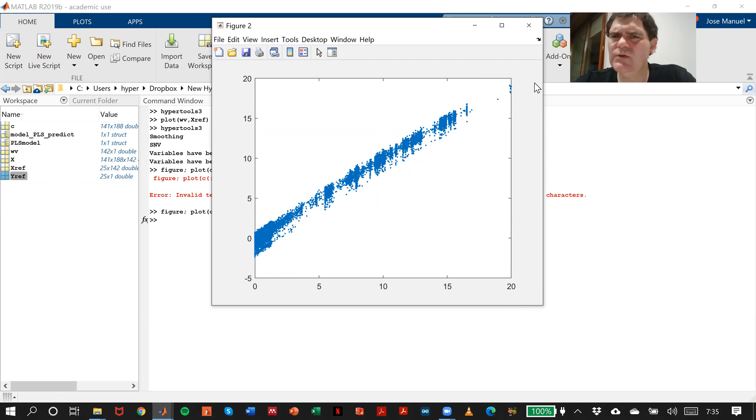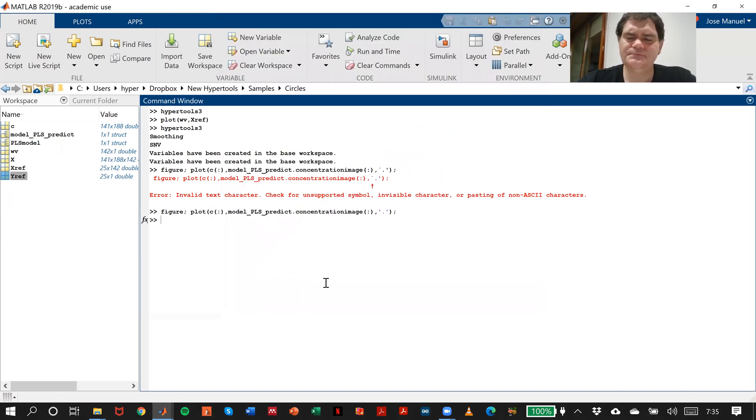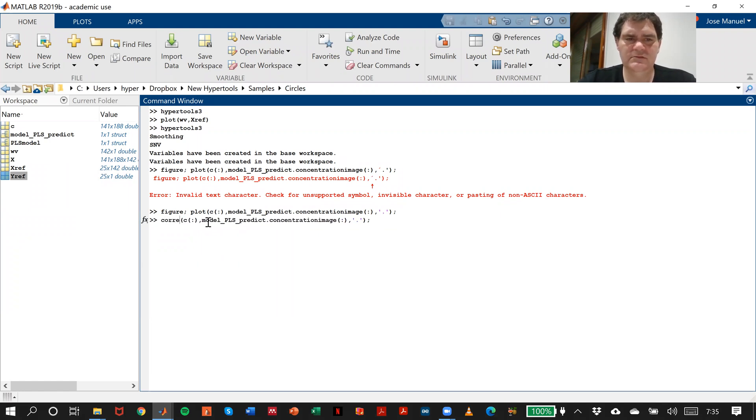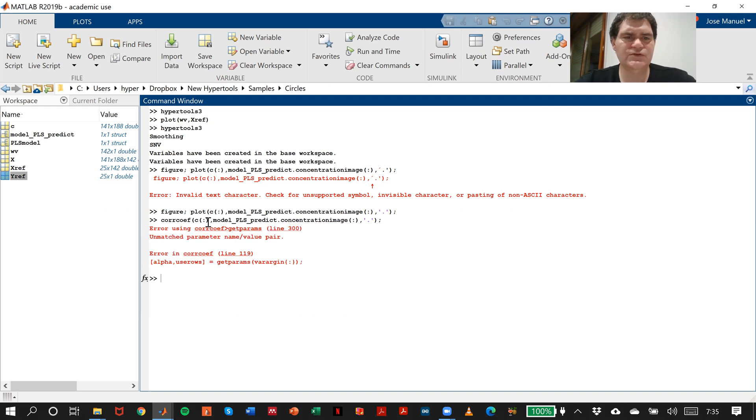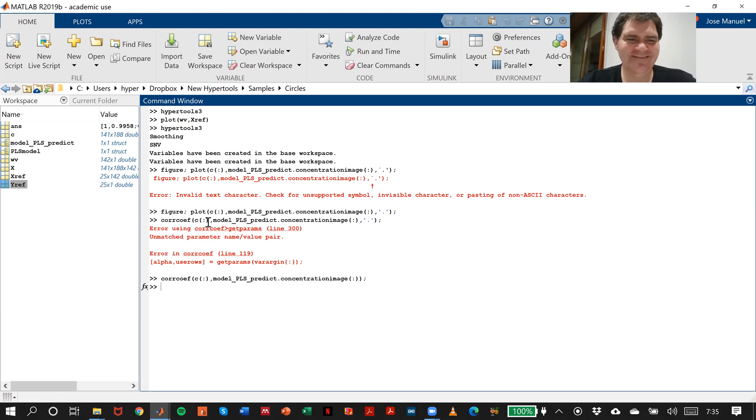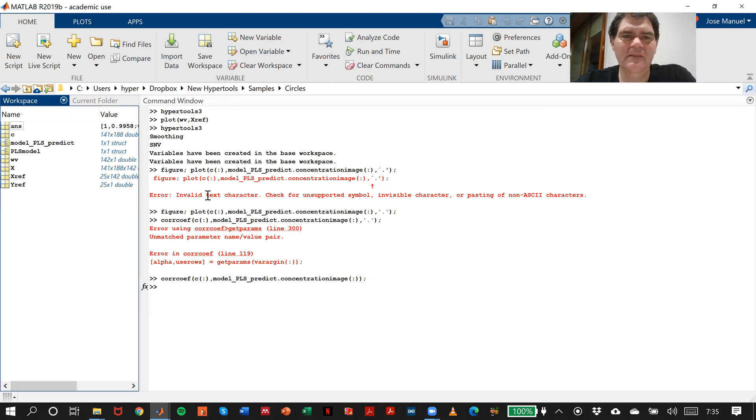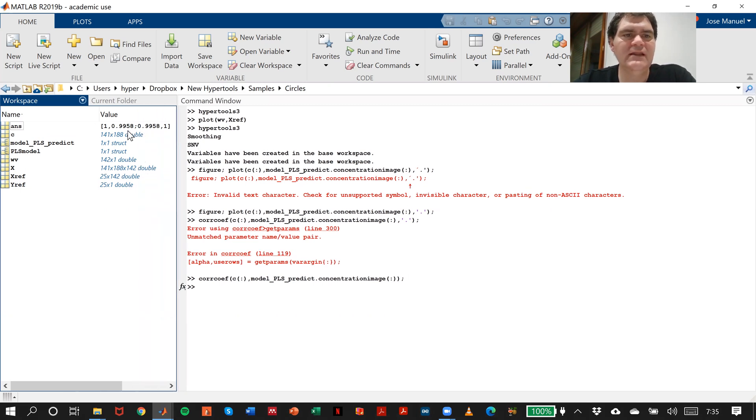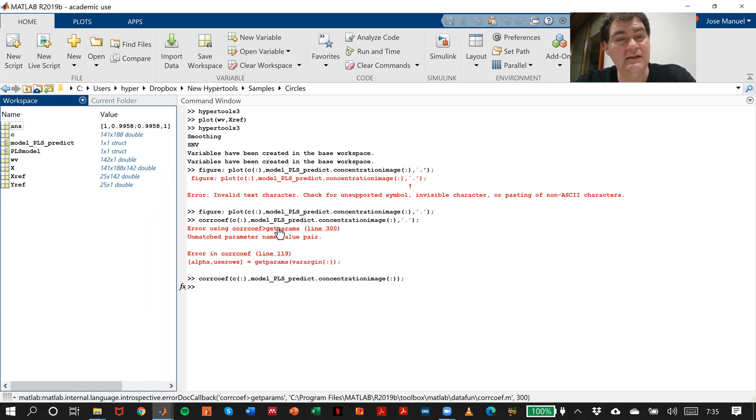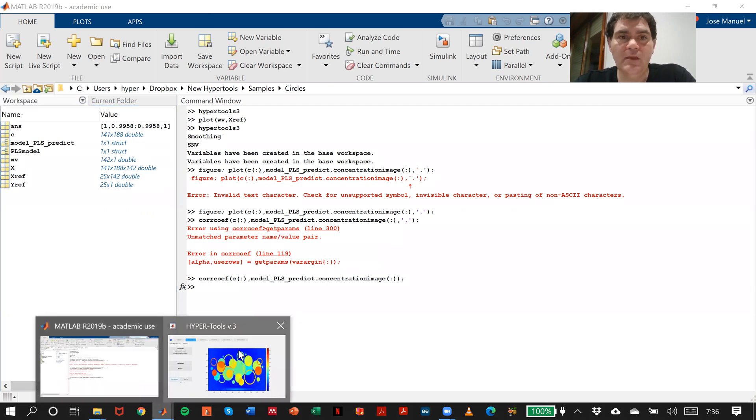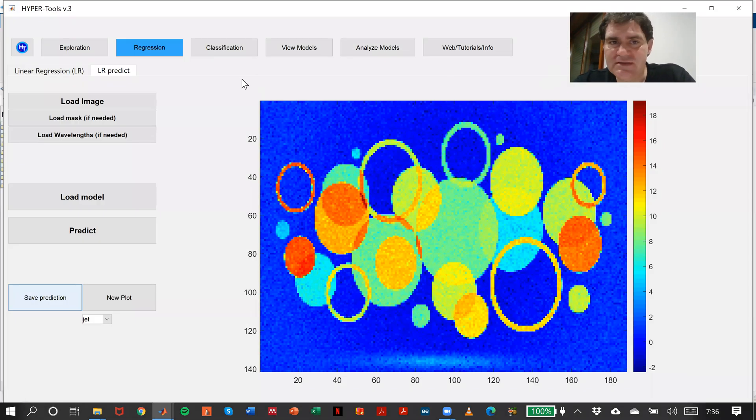Let's see, for the sake of knowledge, what is the correlation. Here we are. We have 99.99 percent correlation between the real and the predicted concentrations, and that is pretty cool actually.